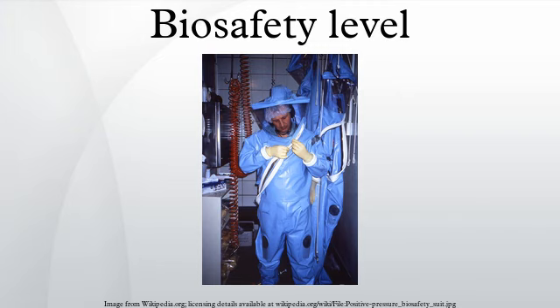History: the first prototype Class 3 biosafety cabinet was fashioned in 1943 by Hubert Kaempf Jr., then a U.S. Army soldier, under the direction of Dr. Arnold G. Wedum, Director of Industrial Health and Safety at the United States Army Biological Warfare Laboratories, Camp Detrick, Maryland. Kaempf was tired of his MP duties at Detrick and was able to transfer to the sheet metal department working with the contractor, the H.K.